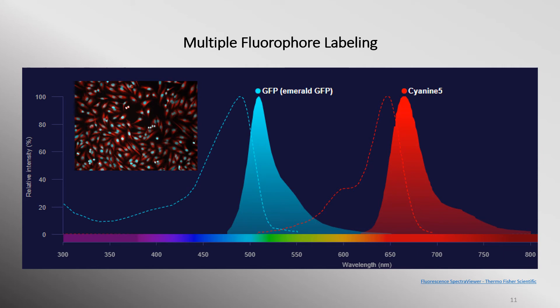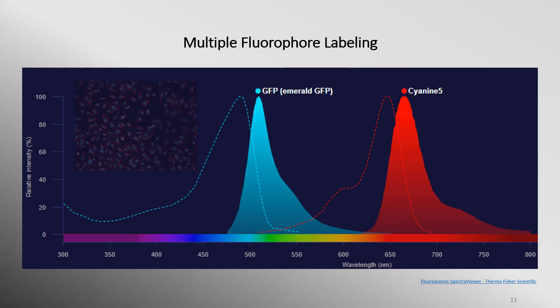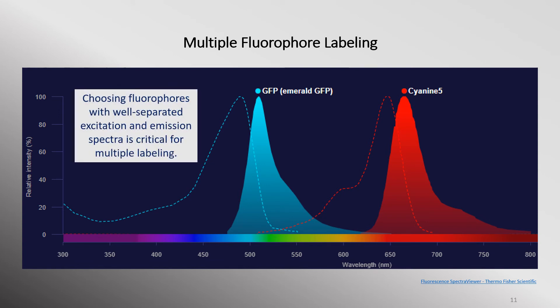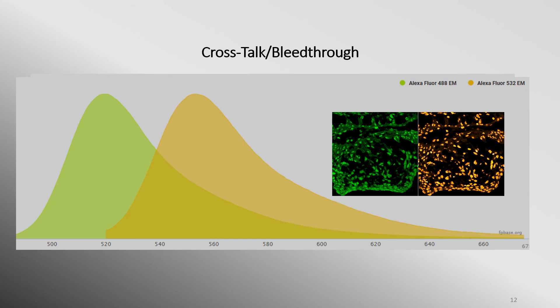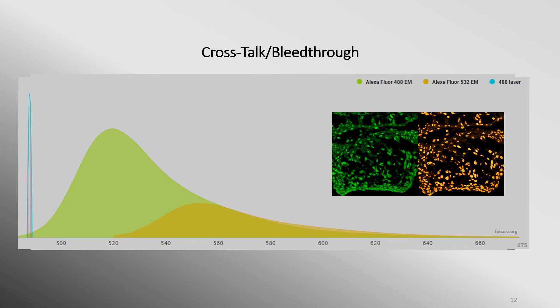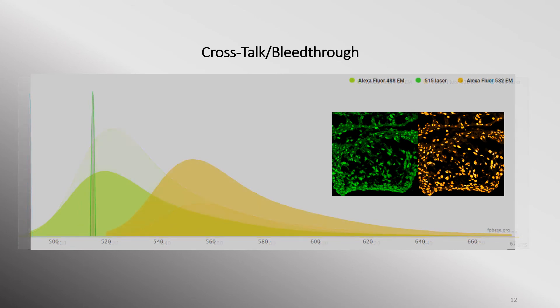In fluorescence microscopy, it is often necessary to selectively label sample structures with differently colored fluorophores in order to study interactions. Ideally, you should choose fluorophores that are well separated in terms of their excitation and emission spectra. Imaging a sample labeled with two or more fluorescent dyes that have overlapping excitation and emission spectra usually brings about a common microscopy problem known as crosstalk. For example, exciting Alexa Fluor 488 with a 488 nanometer laser also excites Alexa Fluor 532. Exciting the latter with a 515 nanometer laser also partially excites Alexa Fluor 488. Overlapping spectra can give false negatives or positives, or otherwise obscure data.